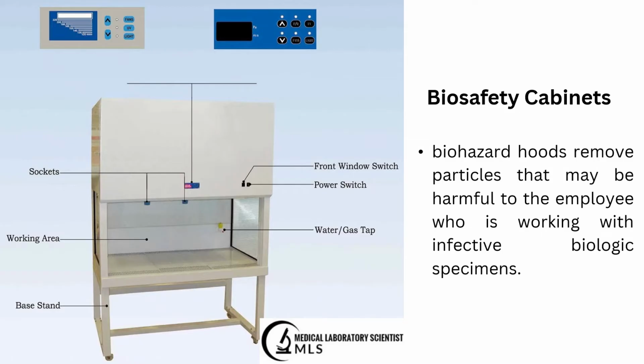As for biosafety cabinets, they remove particles that may be harmful to the employee who is working with potentially infectious biologic specimens. The Centers for Disease Control and Prevention and the National Institutes of Health have described four levels of biosafety. Remember the four different biosafety levels that I taught to you during your PMLS 1?